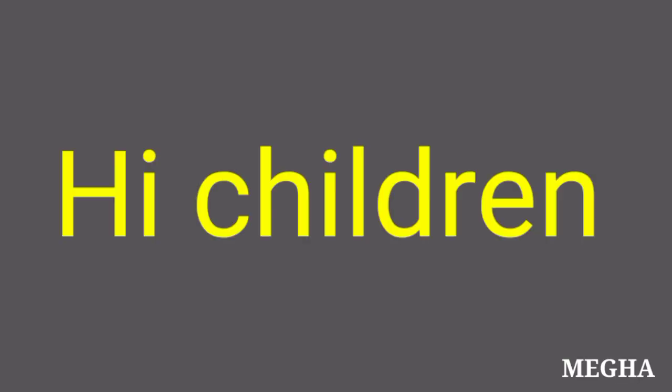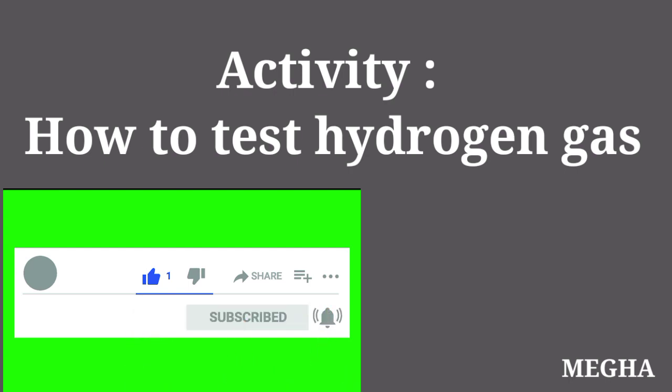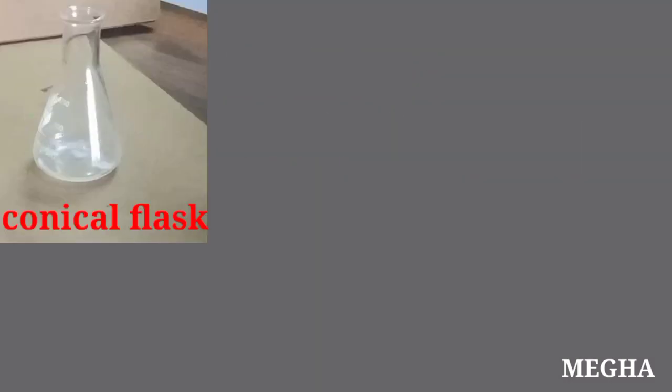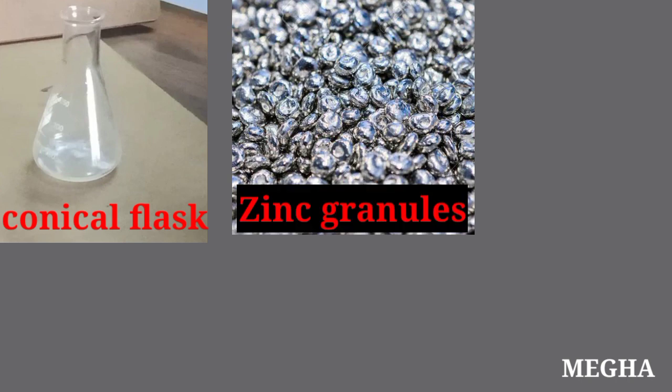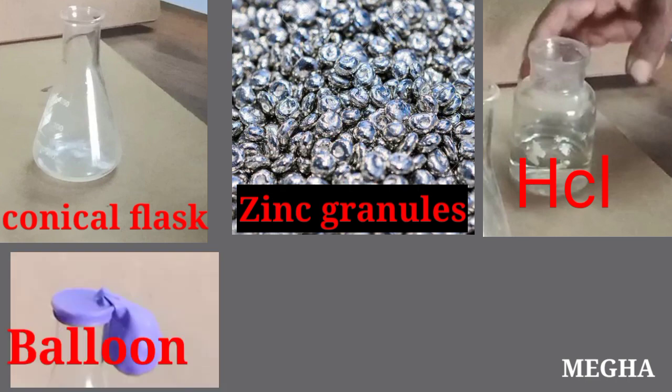Hi children, let us do a small activity. How to test the hydrogen gas? Material required: conical flask, zinc granules, HCl, hydrochloric acid, balloon, matchbox.